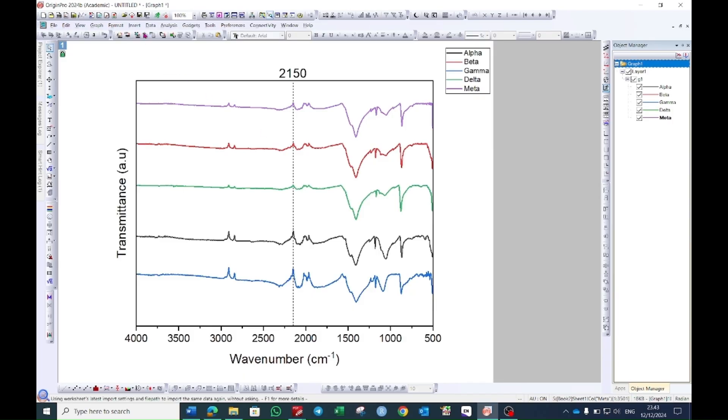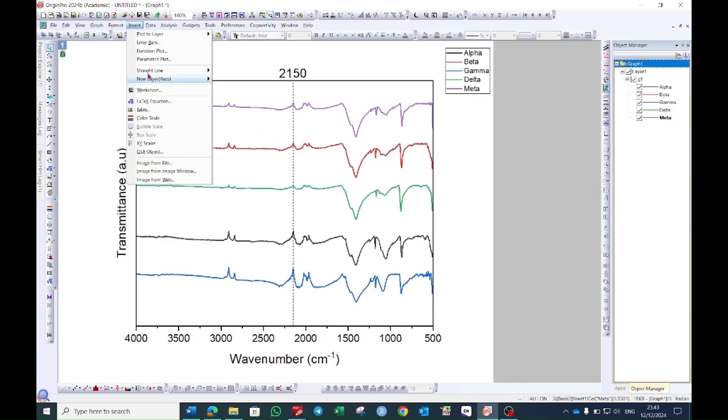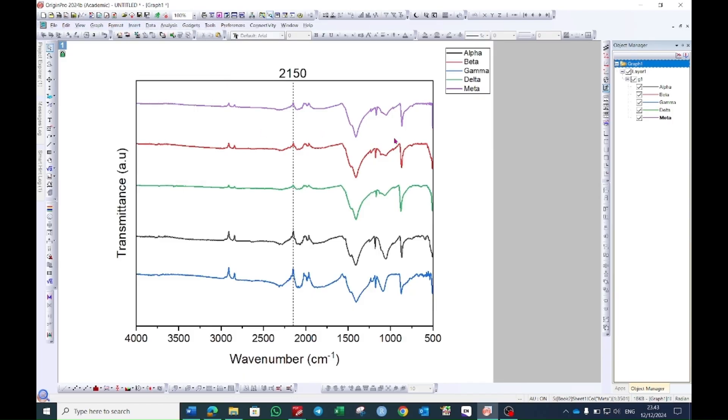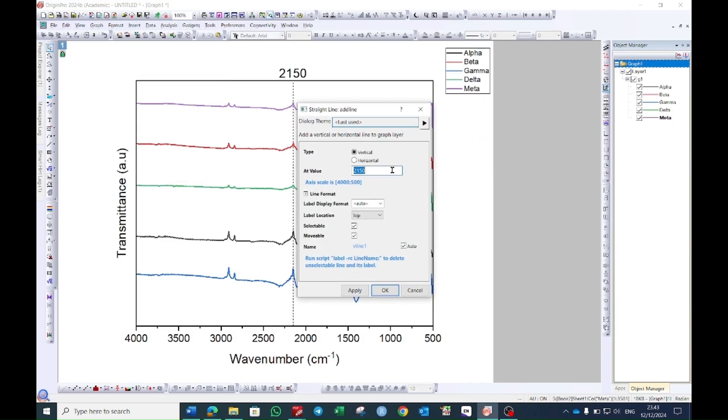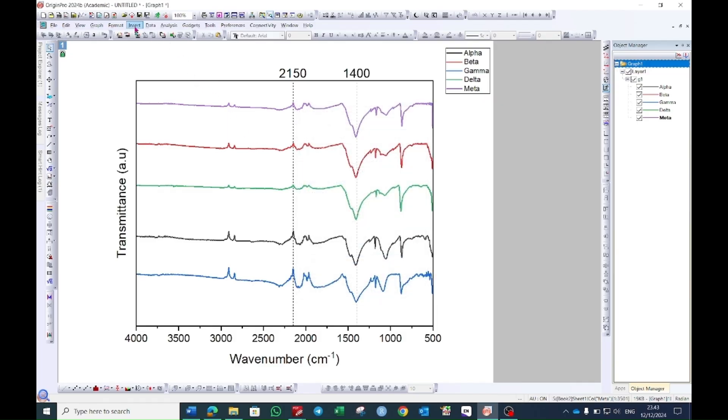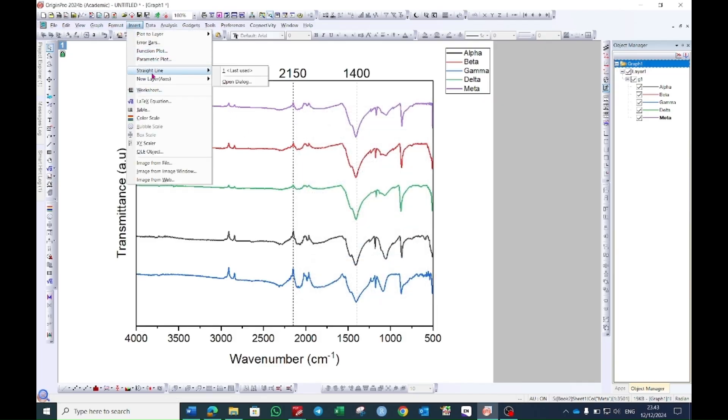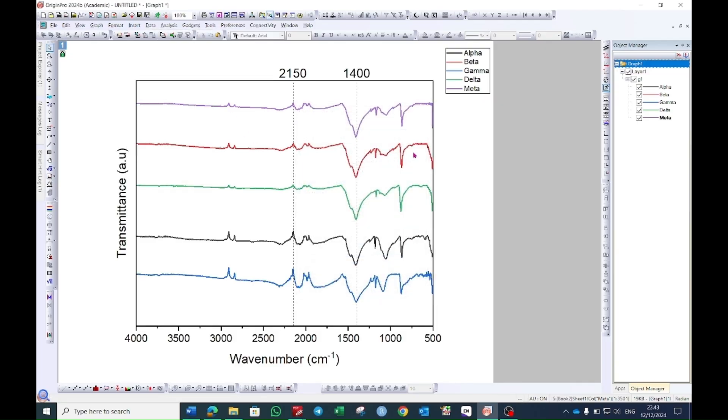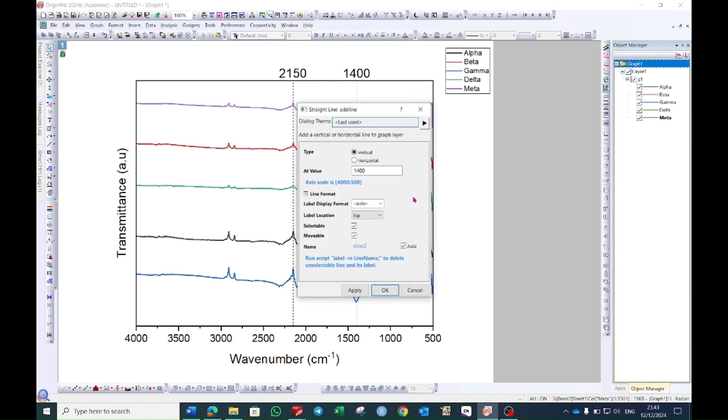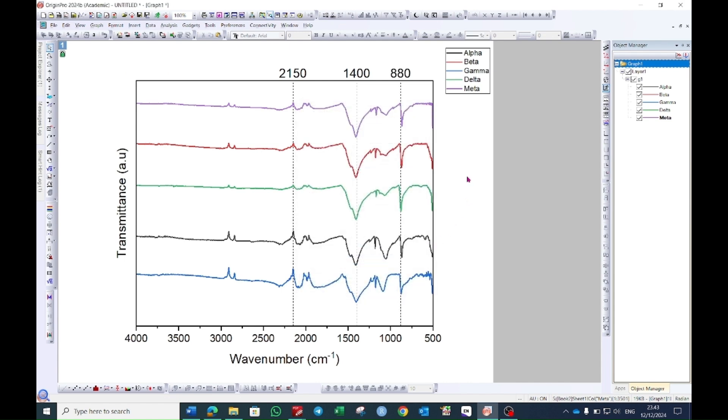I also want to show two more peaks. For example at 1400 and at let's say 880. By doing so you can select as many peaks as you want.